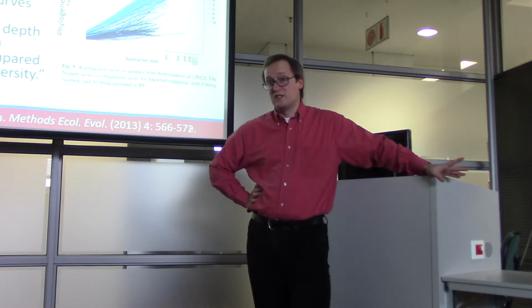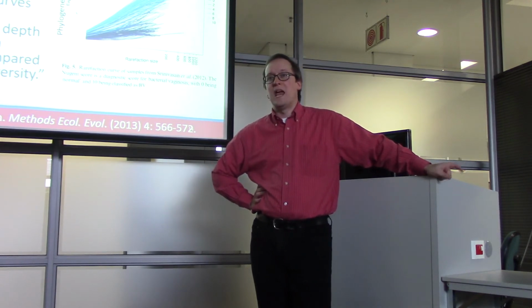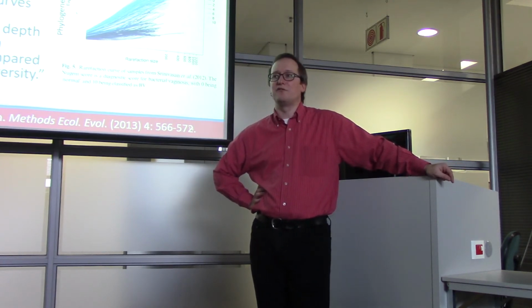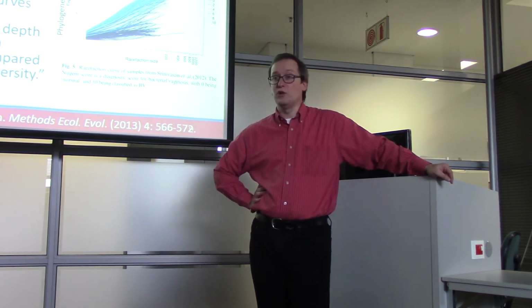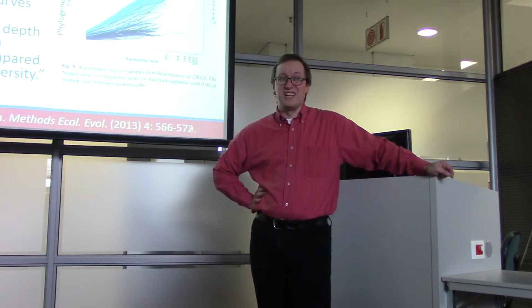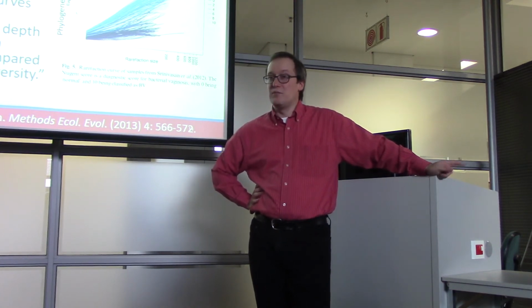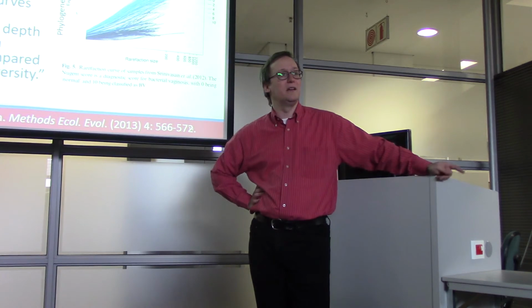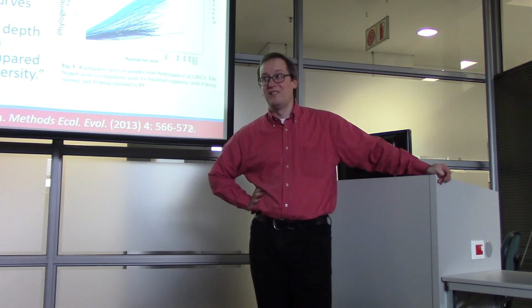Something I've totally omitted so far is the degree of specificity we get out of OTUs. How often is an OTU that we get from Greengenes all the way down to species level? Has anyone looked at data sets of this type? Very, very frequently, you're doing very well just to get genus, let alone the species. So a lot of the time, the OTUs that are produced by a lookup in Greengenes or RDP or whatever will not be all the way to the species level.